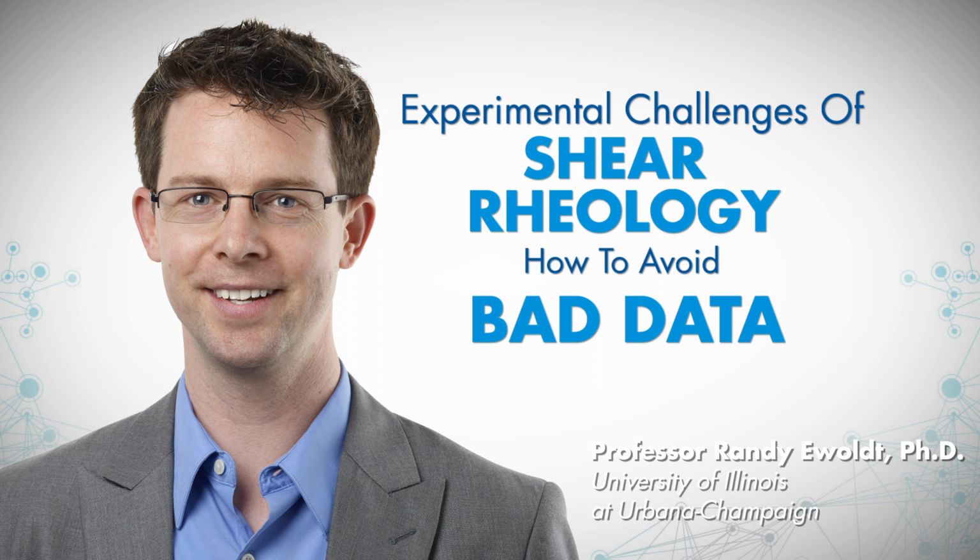If you're using a separated motor transducer instrument, then the lowest speed that you can impose sets a limit on the lowest shear rate that you can go to. If you're using a combined motor transducer instrument that's more nominally torque controlled, then your lowest velocity is more limited by your patience to measure enough displacement over enough time that you're confident in calculating a time derivative to get the slope of that curve to get a velocity.